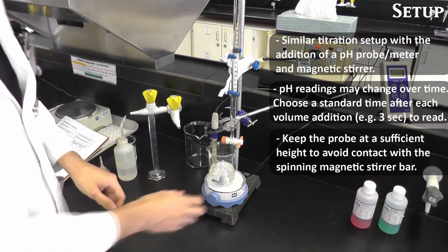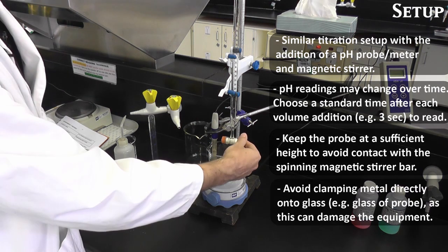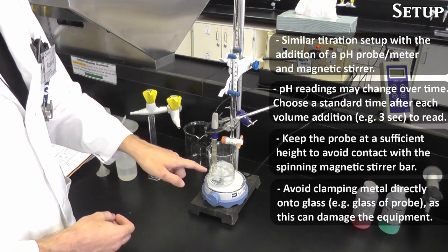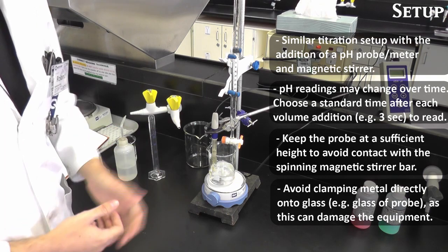There's also a magnetic stirrer in there that you can see once I turn it on, starts to spin, and the rest of the setup is essentially the same for our titration. We want to make sure that we can turn that tap without any other interference. And it's very important when this magnetic stirrer bar is spinning that it does not hit the tip of this pH probe because it is glass and could break.